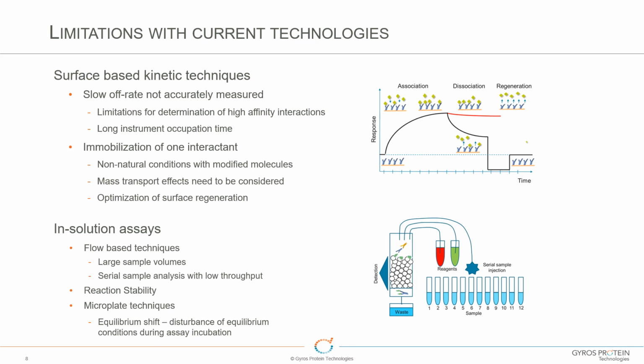So that may not be reflective of the biological situation, or it may be for something like a cell surface marker, for example, but obviously you need to think of what the interaction actually is. But it is the gold standard, and when you look at the literature and you're trying to look at a binding affinity, most of the time the number quoted will probably be from SPR.